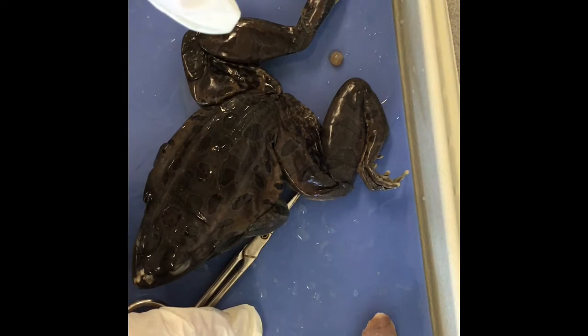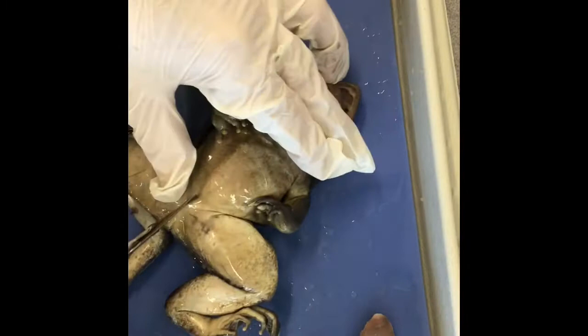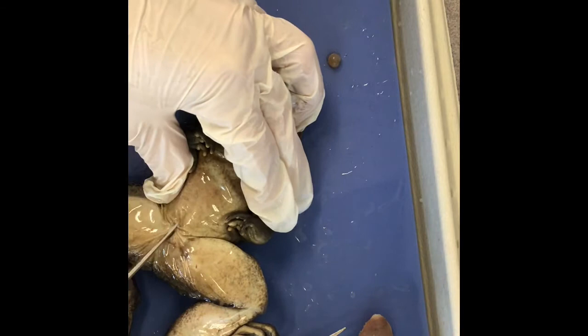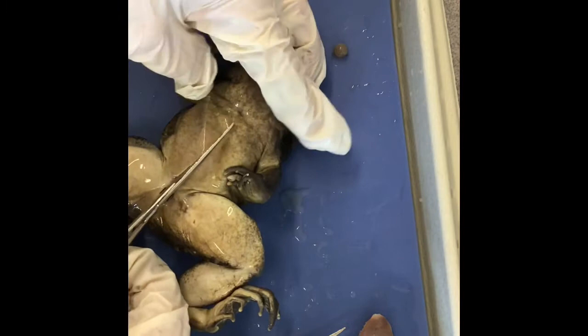Now we're going to open up the frog. I'll just cut a few slits here. On the outer layer of the frog — I'm on the ventral side — there are two layers that I have to cut through: the skin and the muscle.